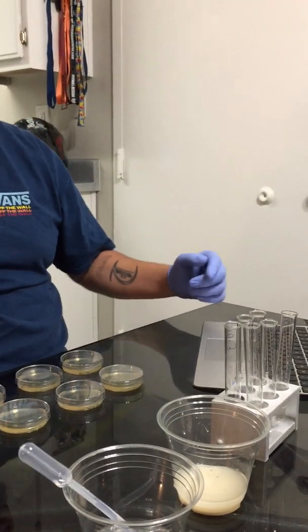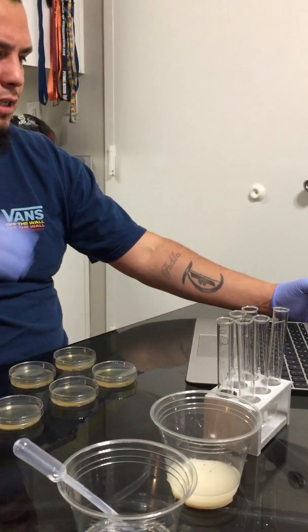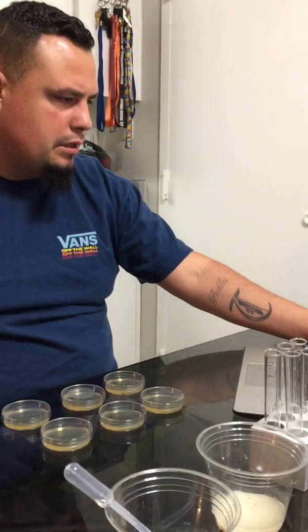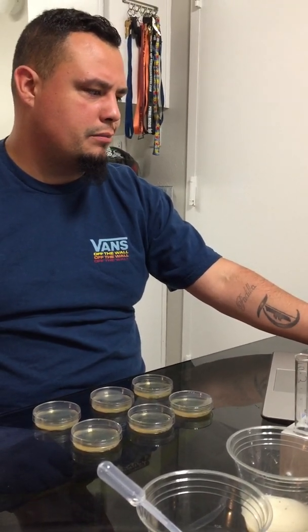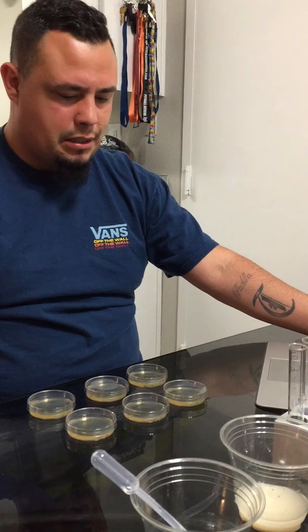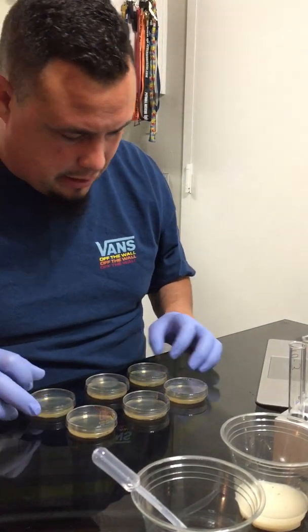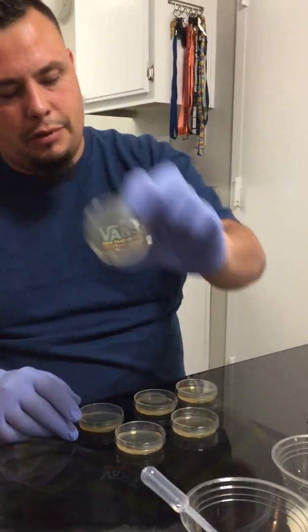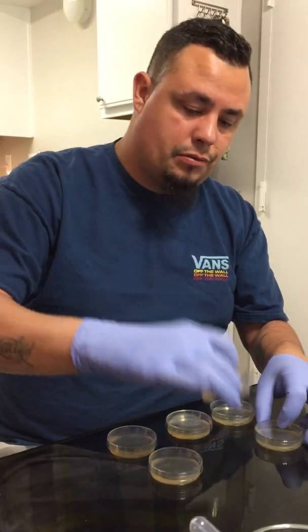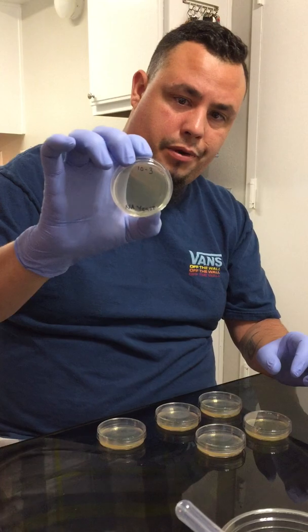Okay, so now that we went ahead and transferred all the yeast and diluted it from one to the other, the next process is to add it to our agar plates. That's going to be part 2, inoculating the plates. So again, I have these labeled as well. So we have 1, 2, 3, we have 4, 5, and 6.